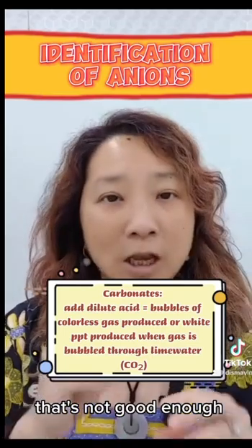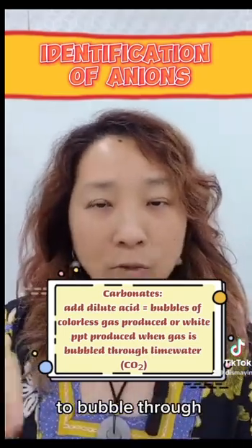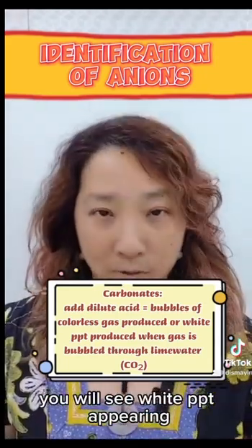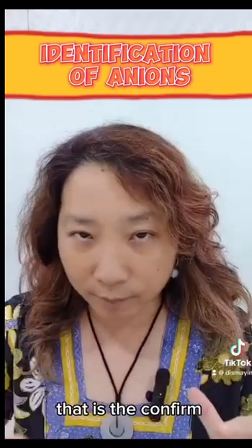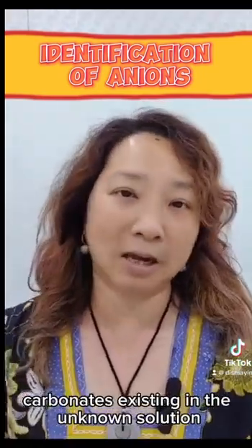That's not good enough. If you were to direct the bubbles of colorless gas to bubble through a test tube of lime water, you will see a white precipitate appearing. That is the confirmed final stage for the test for possible carbonates existing in the unknown solution.